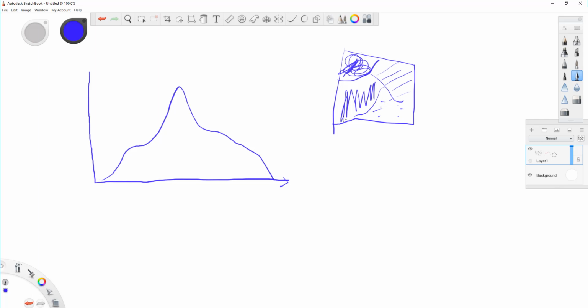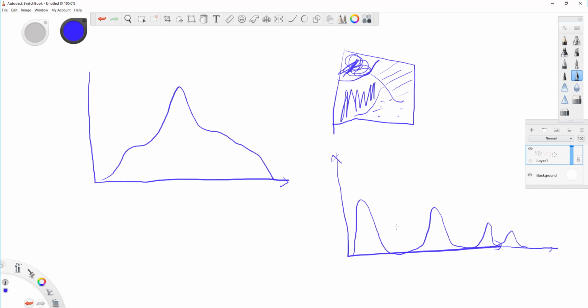If these four regions are very well separable, then you are lucky. Just use the histogram. Do not do anything fancy. If you have an image that has a histogram like that, then just put a hard limit right there, a hard limit right there, a hard limit right here, and these are the windows, and you have your four regions well segmented. This is easy, and then you can use watershed and other methods. But how do you do it if your histogram is this way?